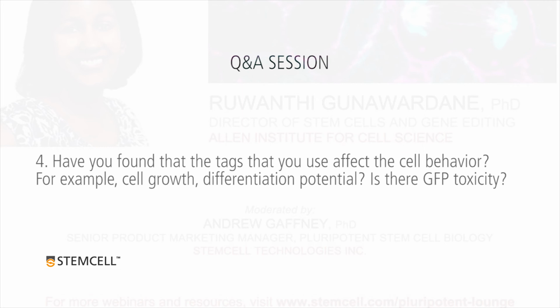So we use a GFP that has been used in the literature and by people for a very, very long time. A lot of people made suggestions on FPs that are newer. We went with the old-fashioned GFP that has been used for a very long time. So it's fully vetted. No, so for every cell line we've generated, we are looking at multiple clones. And like I mentioned several times, we are looking at the unedited cells, right? So we're looking at mitotic index.